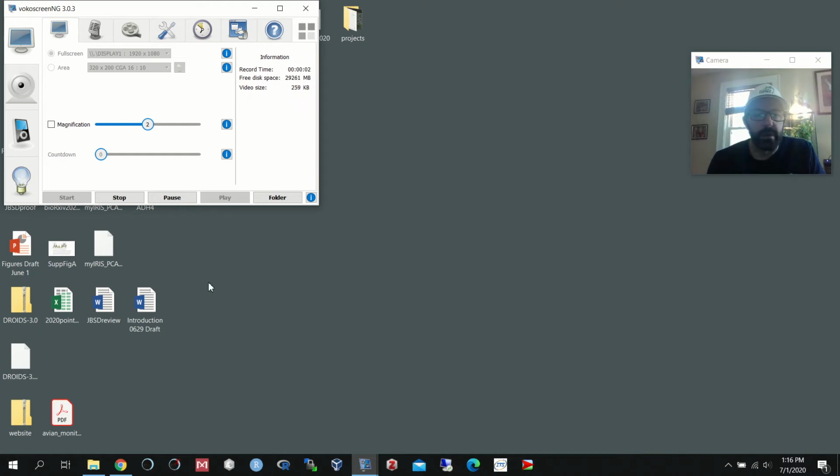Okay, hello everybody. I'm going to go over the software that we'll be using in the course for analyzing gene sequences. First, I'll show you where the website is to access and discover DNA or gene sequences, and then we're going to look at a software program called Mega, which we'll use to analyze those sequences. So this is intended to be a very brief introduction to just get you started.